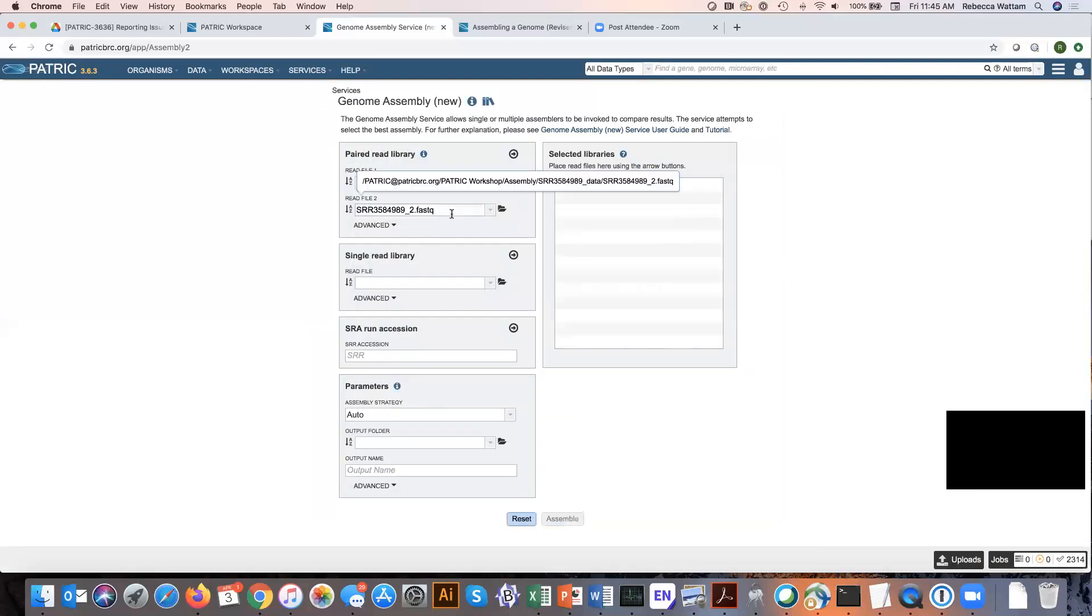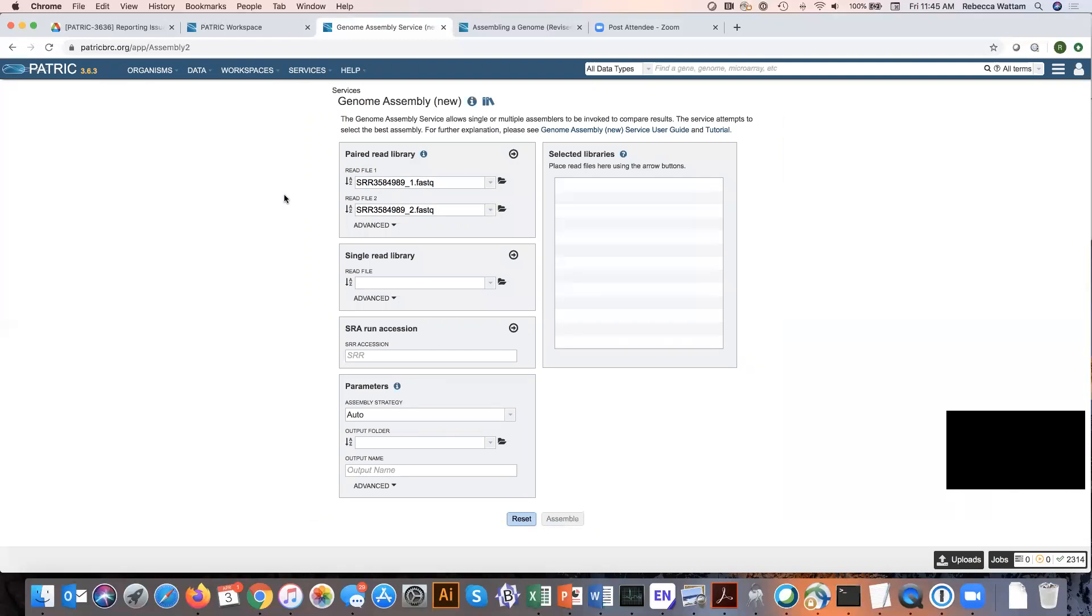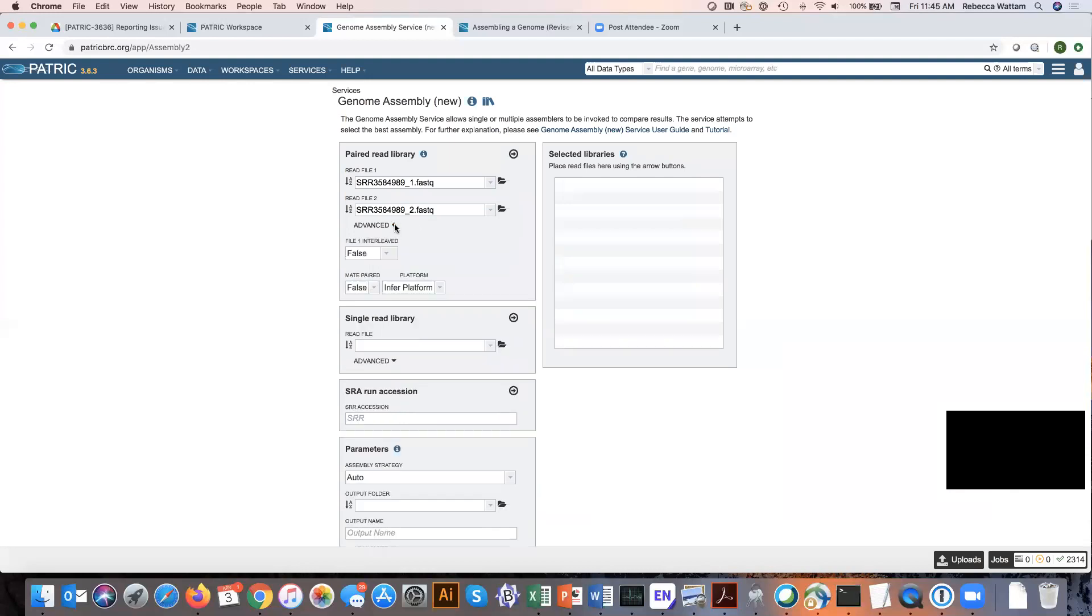So we have our paired end reads here. It's a good time to make sure that they match, that you've got the numbers lined up correctly. You notice there's an advanced button here. Clicking on that shows us three different boxes.